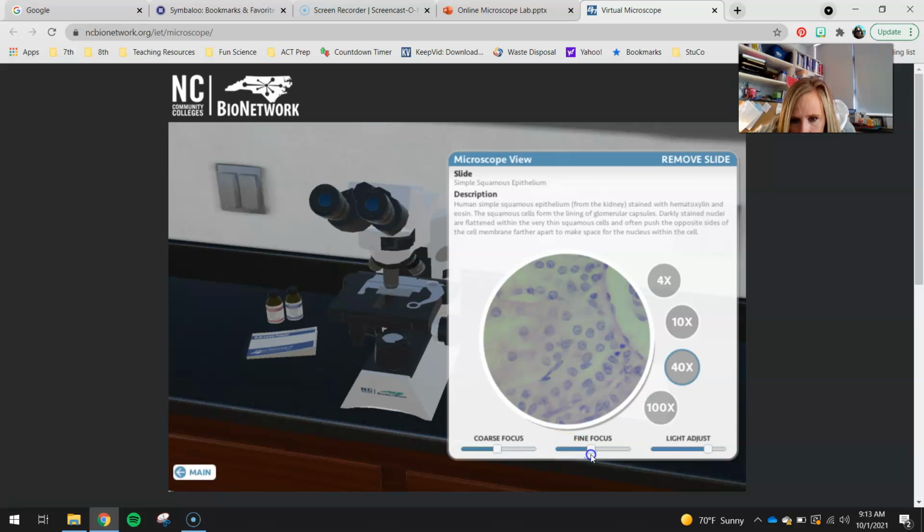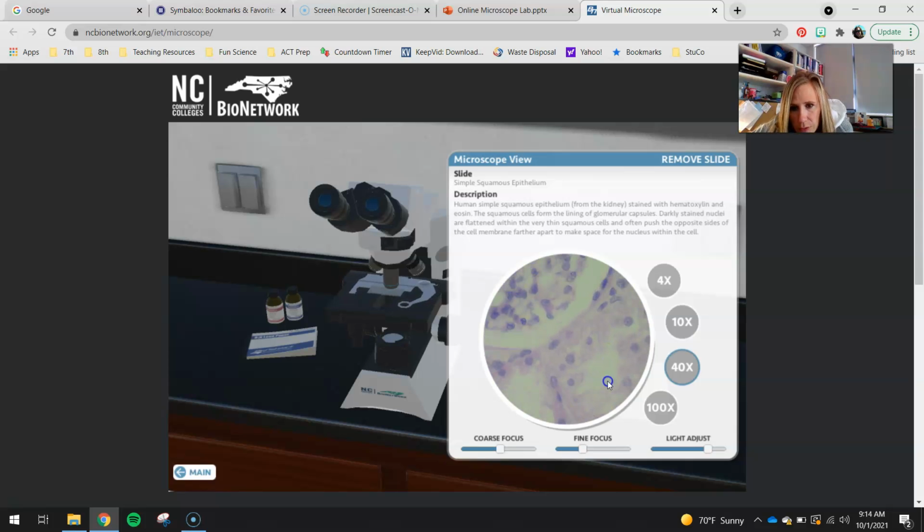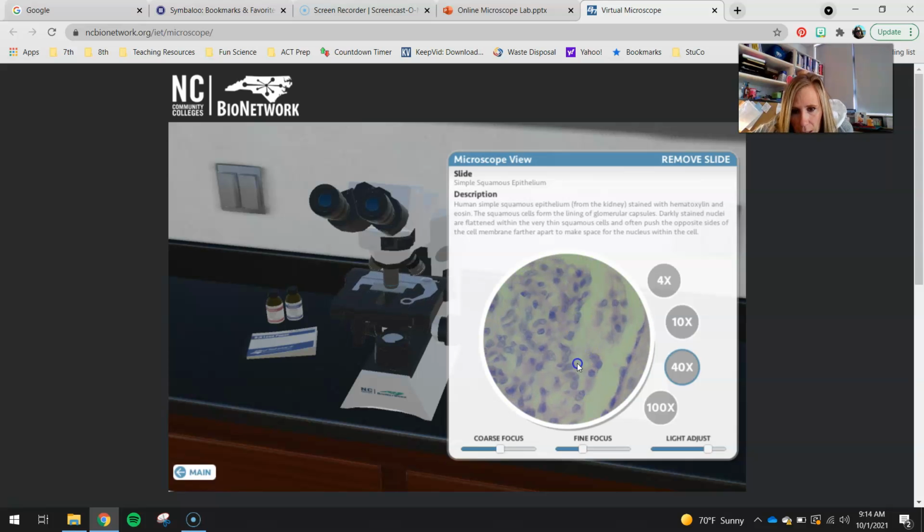These ones are a little bit different. What you will notice with this is that you don't have quite the distinctive edge around your cells like you do with a plant cell. They are not regularly shaped. They have a weird circular shape, whereas a plant cell has this little box shape. So that's a big difference between plant cells and animal cells.